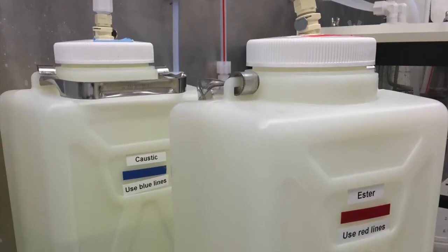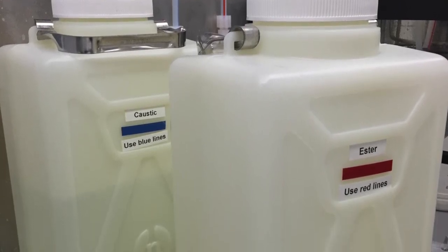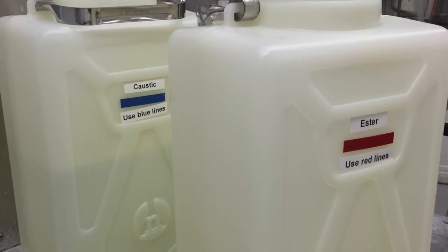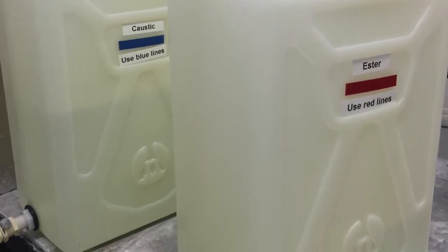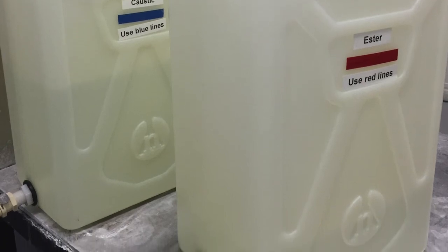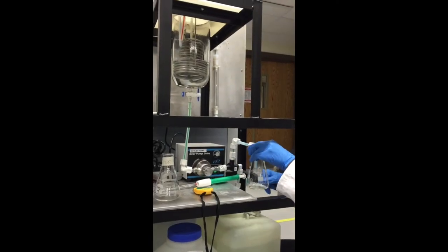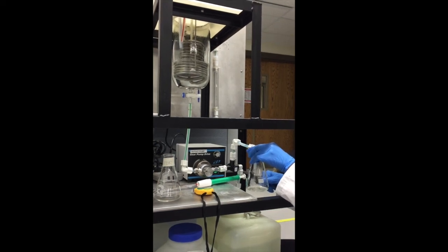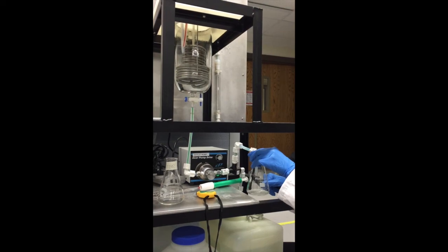Pumping air through the pumps can cause damage to the seals, and after a prolonged time, the pumps will stop working altogether. To prevent any damage to the system, keep watch on the levels of the caustic and ester tanks and try to keep them above 3 liters throughout the experiment, even when flushing the system. The outlet pump controls the draining tank and should not be running if the level of the tank is below 250 milliliters to ensure no air is let in.